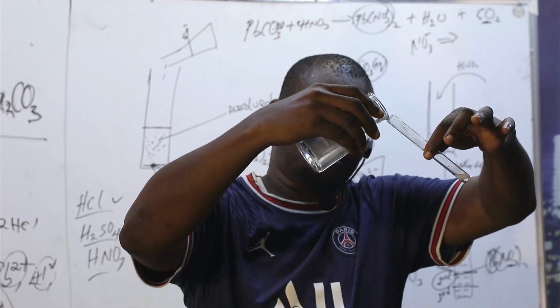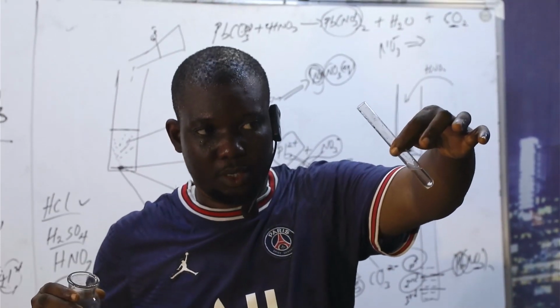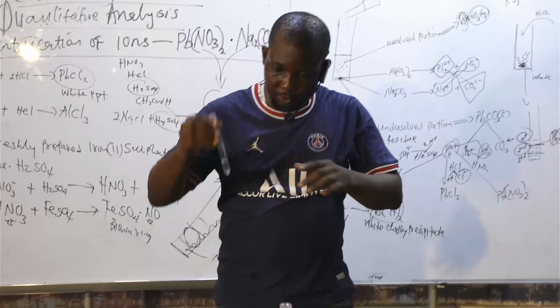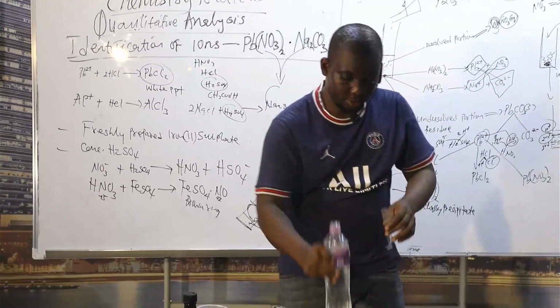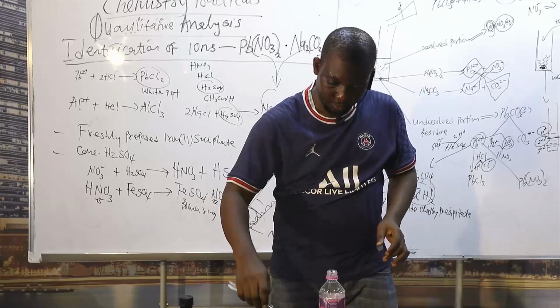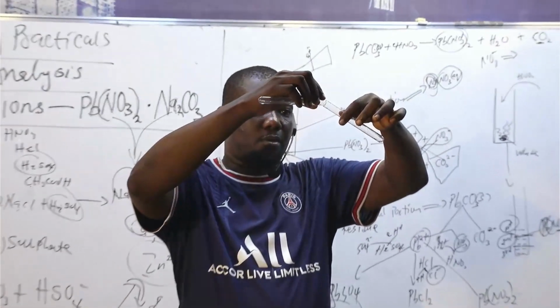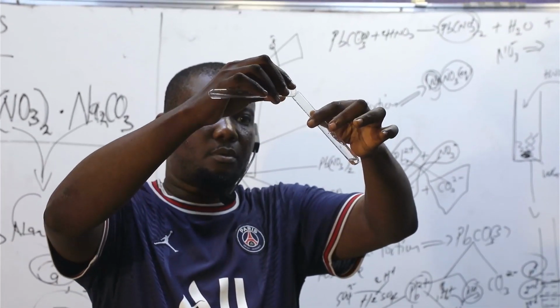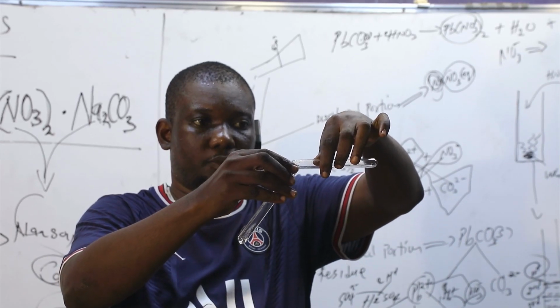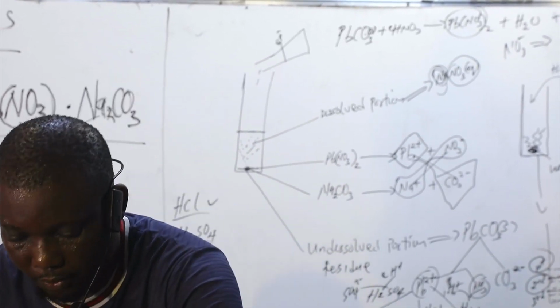Okay, confirm it before you add. In excess, the whole of the precipitate dissolves. Okay, so this is it. I'm going to discard this and rinse. Let's take the next portion. Any quantity can serve. Okay, I think it's okay, so I'll use this for the last tests.